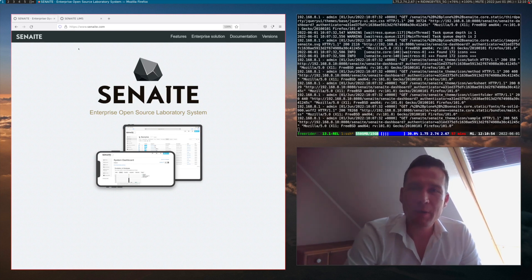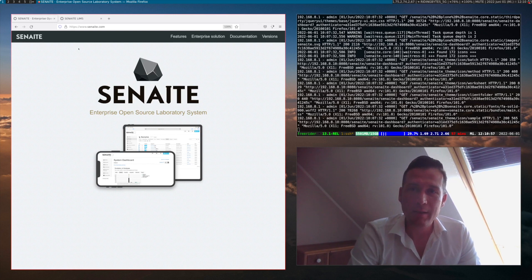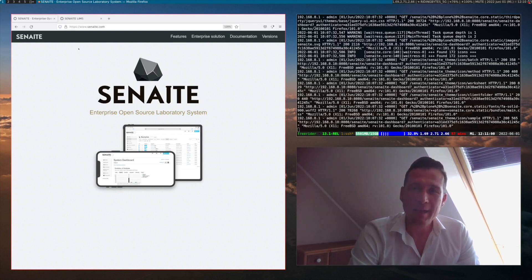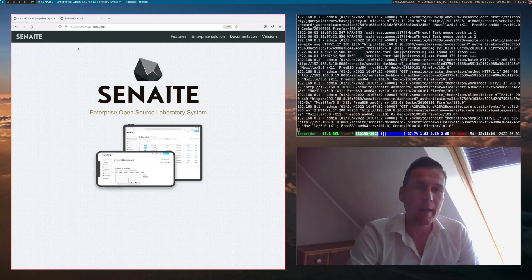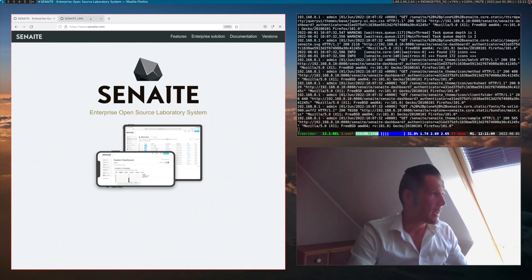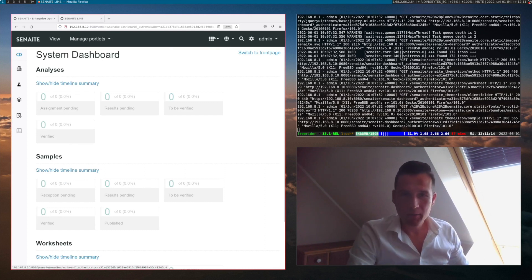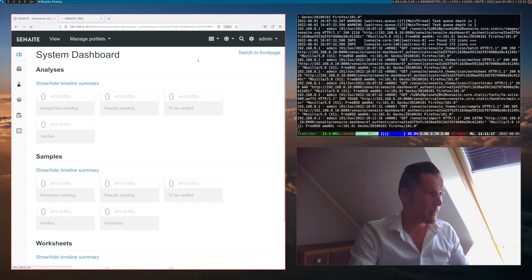In the last video, we've seen already how you can quickly set up Synate LIMS inside a Docker container, and this is exactly the starting point where we will go ahead and install the demo data in the system. Therefore, we go to the start page of the system and click on the little cube icon on the top right corner and click on the import tab.